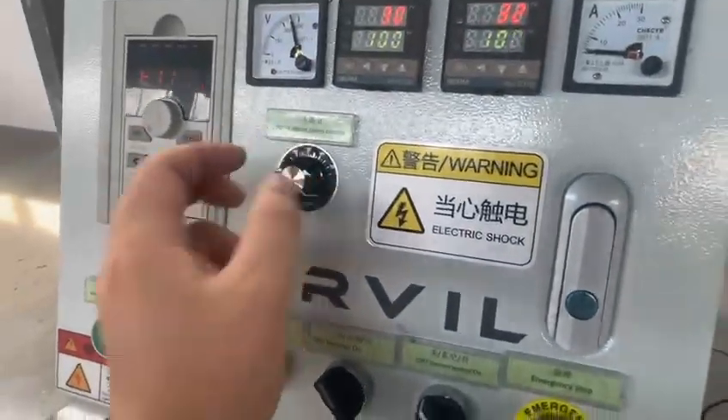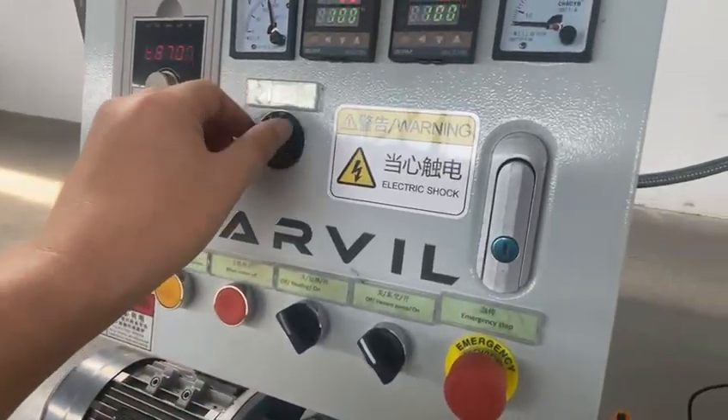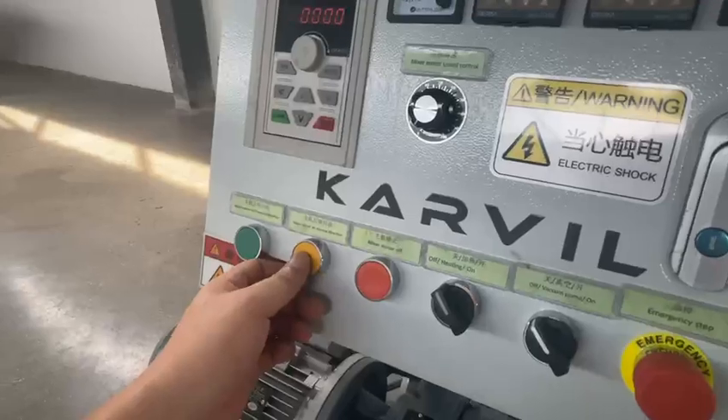The highest speed. Stop it. Turn the switch. No problem.